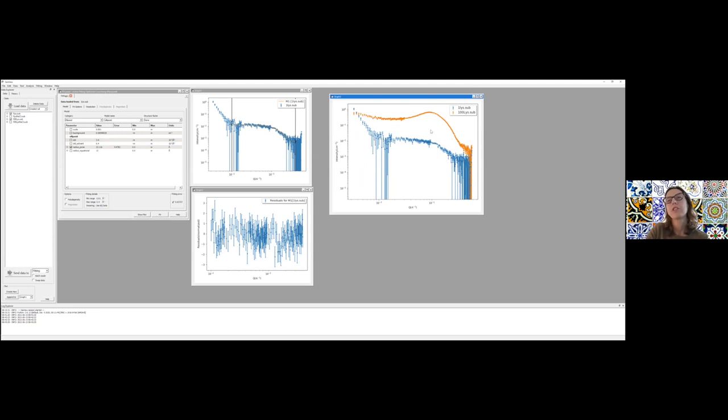And you get this interaction peak that you see here. So now definitely, we don't come up to a plateau at low Q. There's definitely some interaction present, so you definitely want to fit a structure factor to this data set. For the 1 mg/mL, apart from this strange area here that I think comes from air bubbles, you wouldn't expect so much of a structure factor, but we're gonna verify that. And I'm going to show you that for the 1 mg/mL, just so you see how you do it.